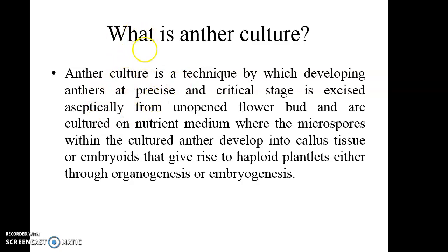Then, in aseptic condition, you excise the anther at a precise and critical stage. Keep in mind, generally the anthers which contain the microspore at the first mitotic stage are selected.